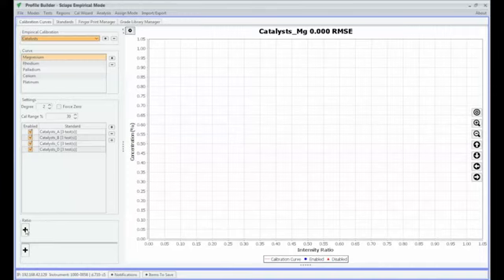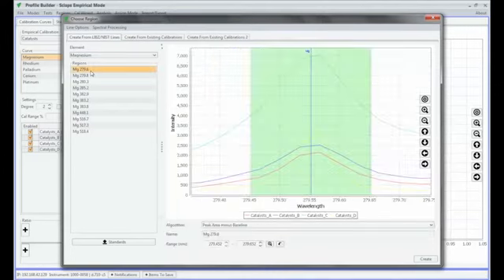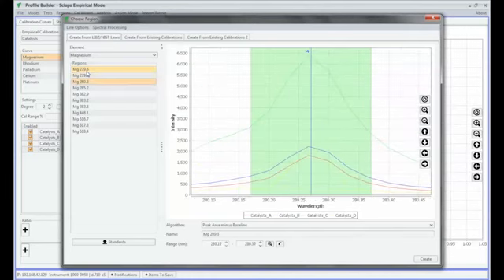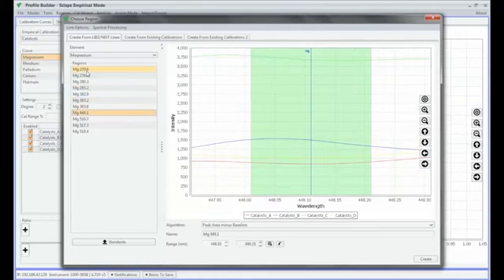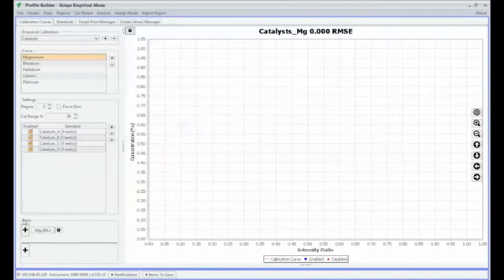For magnesium, I'm going to click in here to our intensity ratio, and in the top part of the ratio we want to have a magnesium peak. When we hit the plus sign, we come to this menu which suggests some possible magnesium peaks that we can try using. So you can click through. Here's a magnesium peak at 279.6 nanometers, and then we can scroll through and look at each one of these different magnesium peaks and quickly judge which peaks look nice and which maybe wouldn't make a very good calibration. So I'm going to jump to this 280.3. This is a common magnesium line that's pretty strong, and I'm going to hit create. So we've got magnesium in the top part of our ratio.